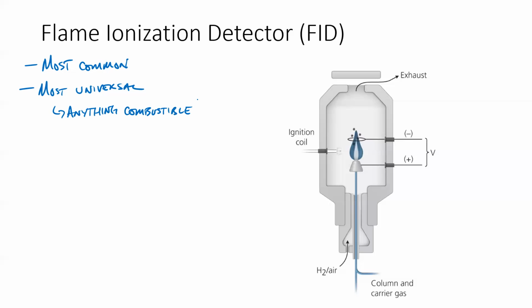Right? And so all organic compounds will combust, right? And that's a whole bunch of what we're interested in when we do analysis. There are some inorganic compounds that usually don't get into the gas phase very well anyway. But virtually all organic compounds will combust when we add them with hydrogen, with oxygen. And so, as long as we can get it to burn, we will be set.